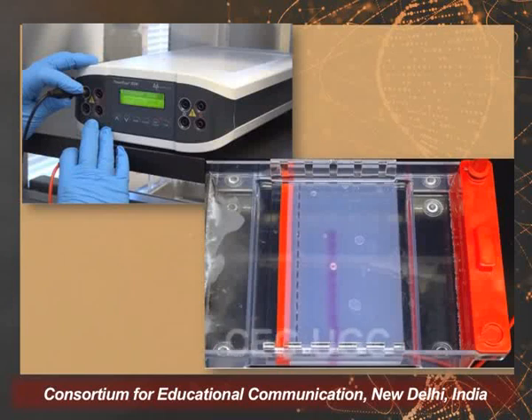Now you can see that blue line, which will help us track where our DNA samples are going. The DNA is above it, and depending upon the size it will be lying somewhere there, but we know that when this dye runs around 3/4 of the gel, then it has sufficiently run and we can visualize it. If the size of the DNA is approximately 200 to 300 base pairs, we need to keep in mind that it does not just flow out of the well.